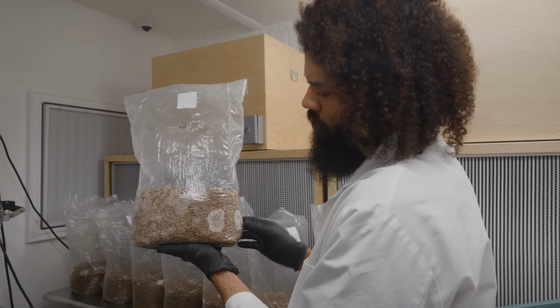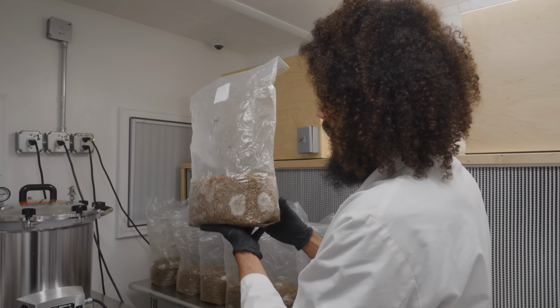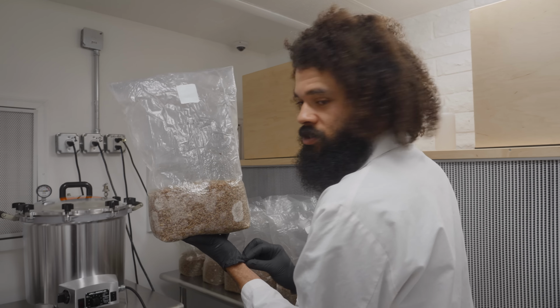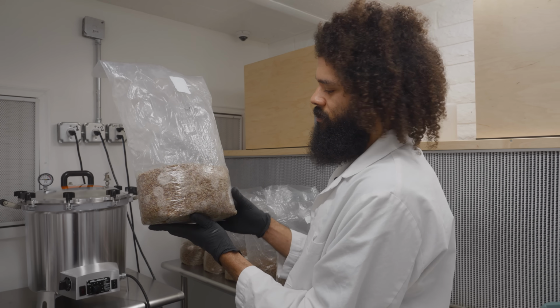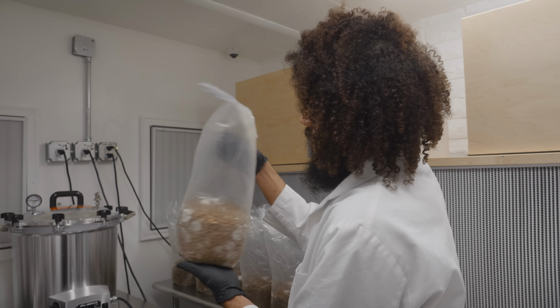So these bags were actually just inoculated about 4 or 5 days ago with a couple agar wedges, and we can see the mycelium starting to weave through the grain. This is just a hard red winter wheat. You could use a variety of cereal grains. We like to use red winter wheat or white proso millet or milo.